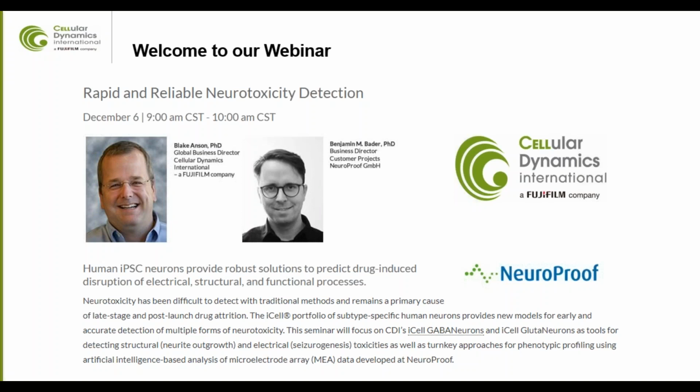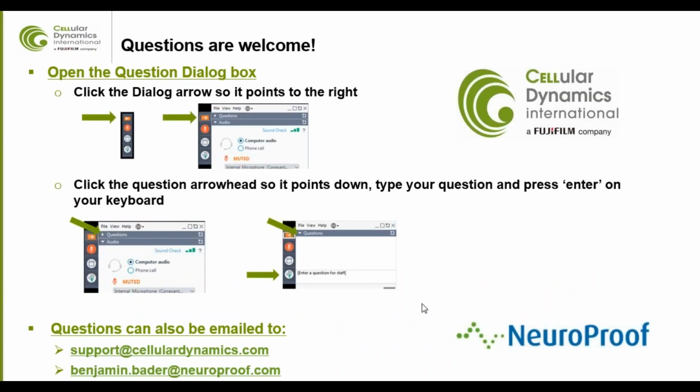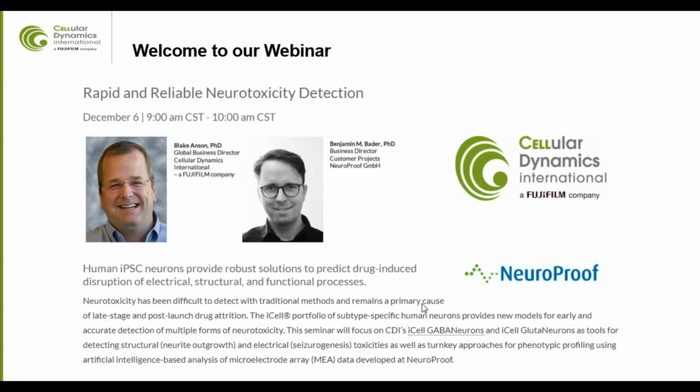I am at Cellular Dynamics, and I welcome you to our webinar, where we will discuss rapid and reliable neurotoxicity detection with myself and Dr. Benjamin Bader from Neuroproof, GmbH. We're going to really focus in today on looking at how stem cell-derived neurons can provide multiple answers to various forms of neurotoxicity. And we'll be focusing here on both GABAneurons as well as GlutaNeurons.